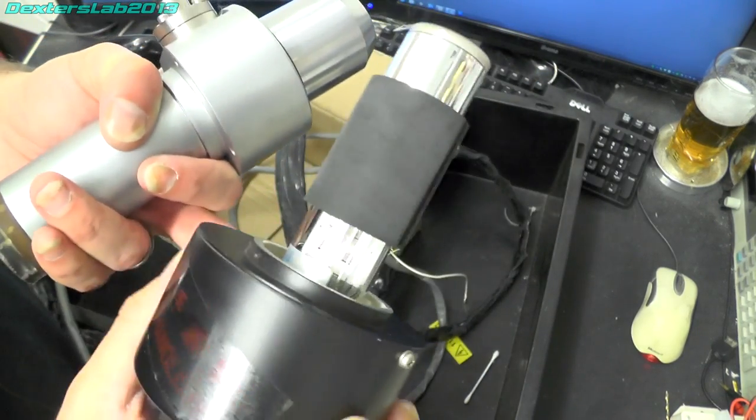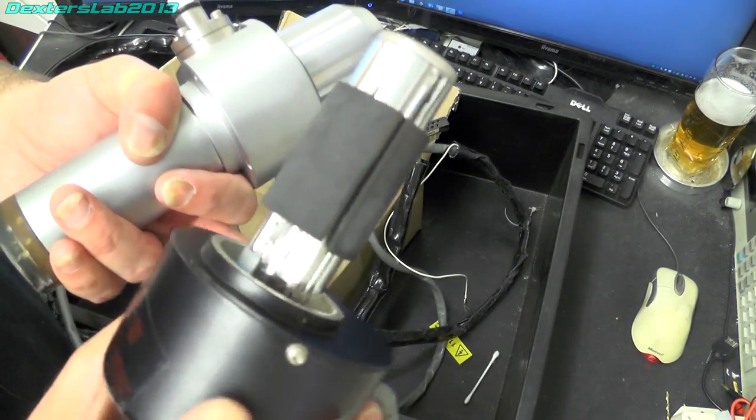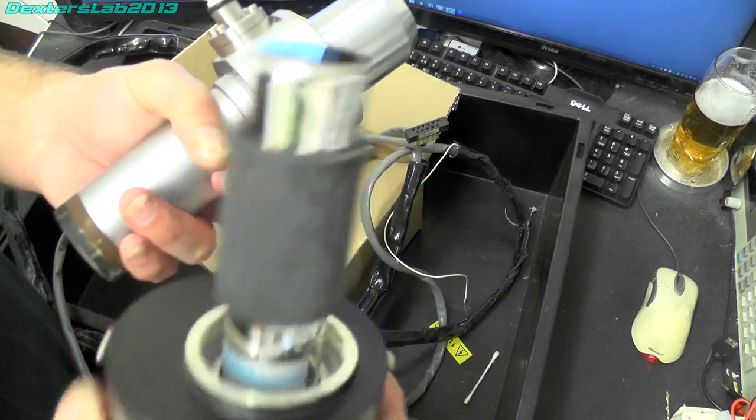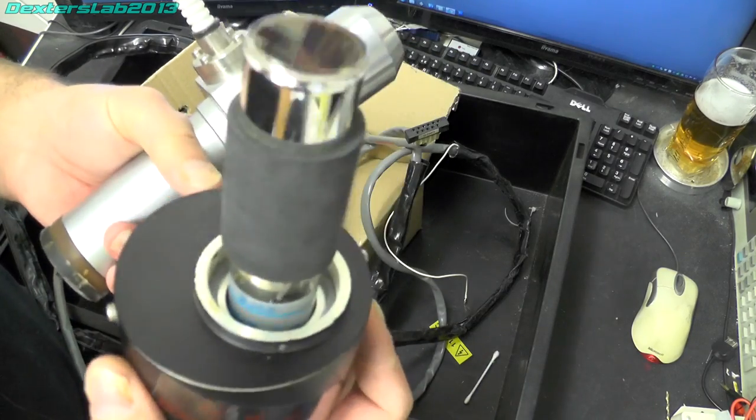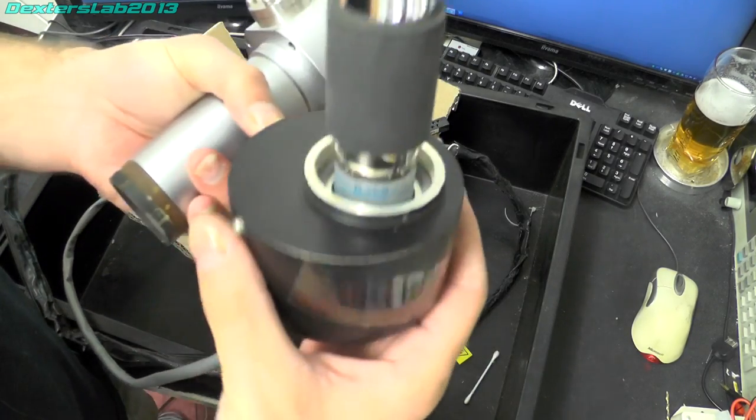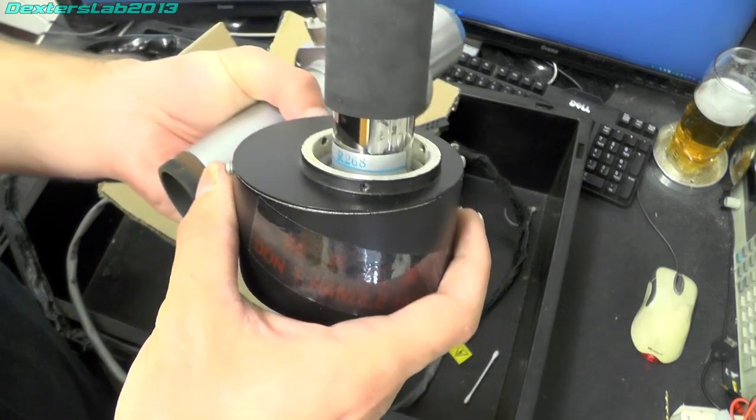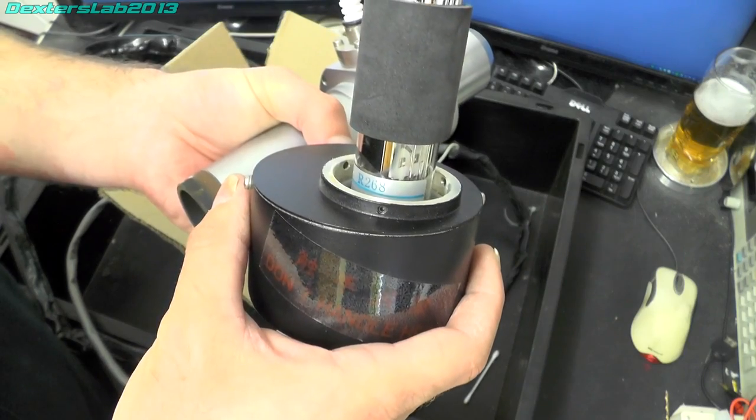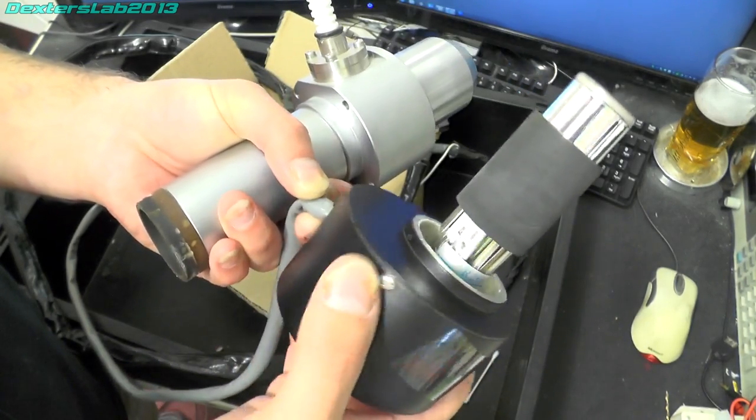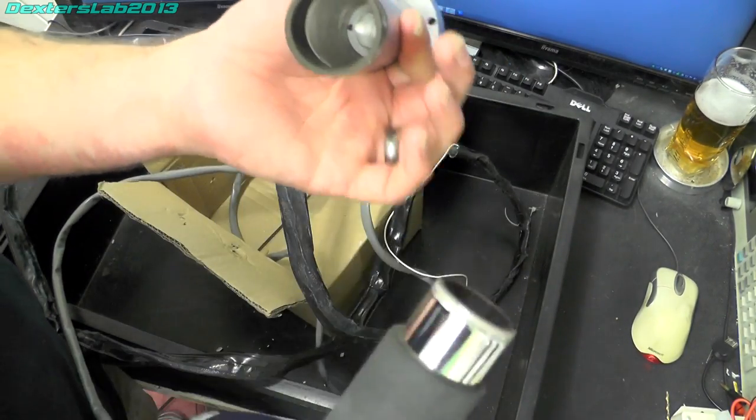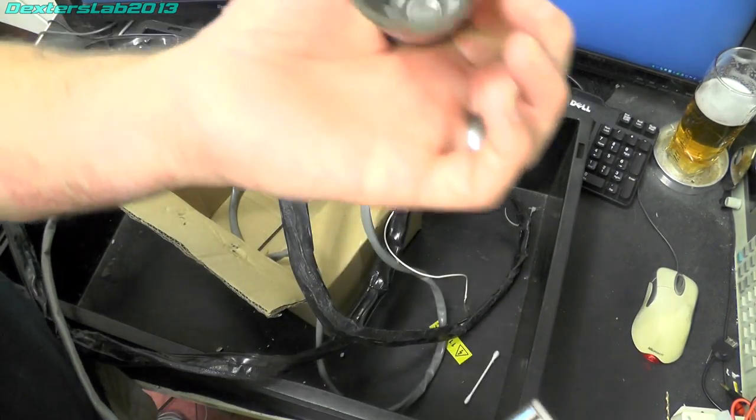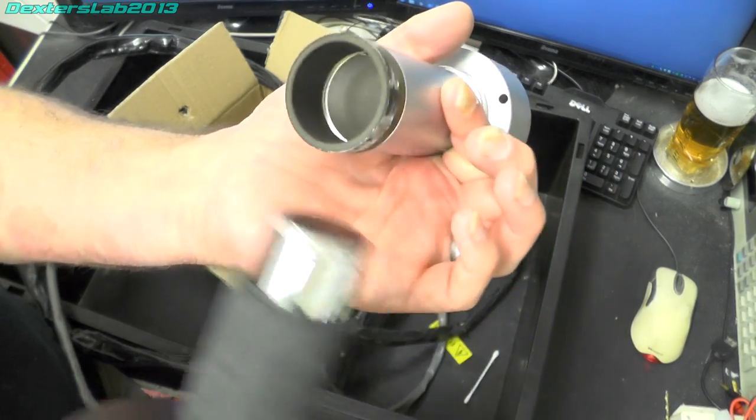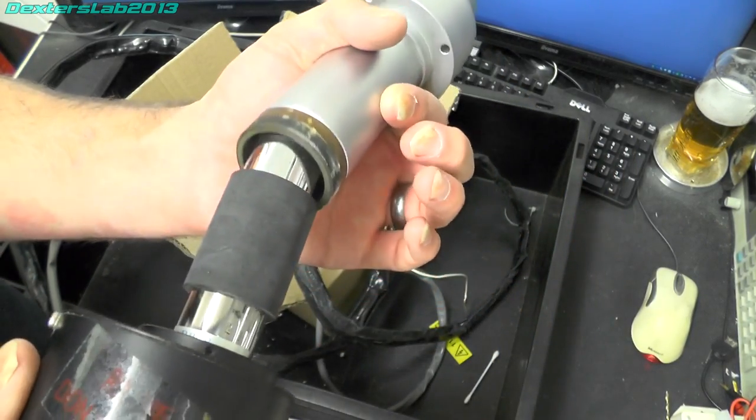So obviously I don't know if that's working. Chances are it should be unless it's been burned. But that is a Hamamatsu R268 photomultiplier. And you can just see the window down at the base of the tube there.